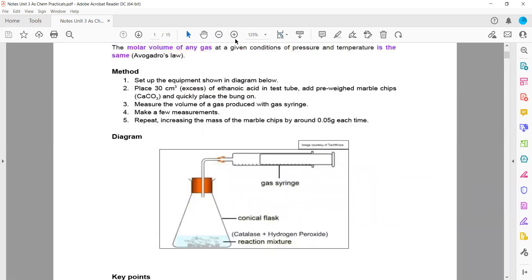To carry out this experiment, we need reagents that can release gas. A reaction that gives off gas can be used to work out molar volume. Set up the equipment as shown in the diagram. Connect a gas syringe, or instead of a gas syringe you can have an alternative setup.